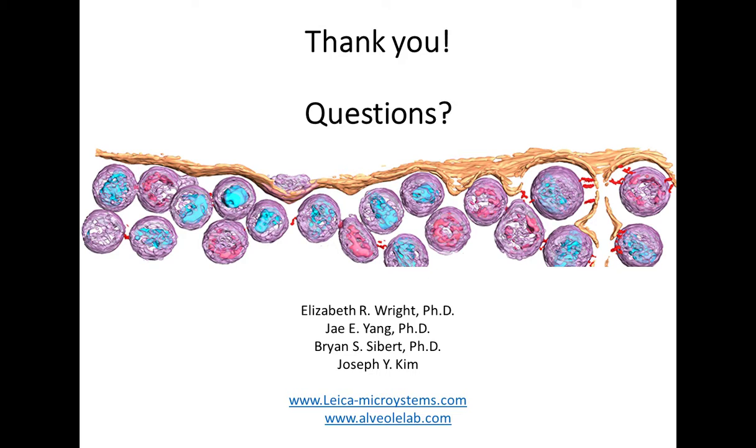How do you envision microfluidic technologies playing a role in cell preparation for cryo-electron tomography of a cell? Yeah, so this is a great question. In our current setups, where we're culturing cells on a variety of different substrates, including EM grids made of carbon and copper or gold, or silicon-based materials, most people are just growing these in culture media and allowing them to propagate as they would.